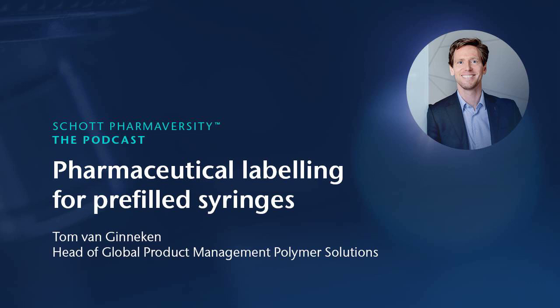Mm-hmm. I see. So we're actually looking overall into the efficiency and the usage of labels here, where you can really use the way which you already have, but make it much more efficient by using the labels. But you mentioned a lot of different things now that you can improve through using the labels. How does it come that exactly these topics like UV or oxygen permeability or barrier properties are relevant for the combination of a label and a container, or a polymer container in this case?